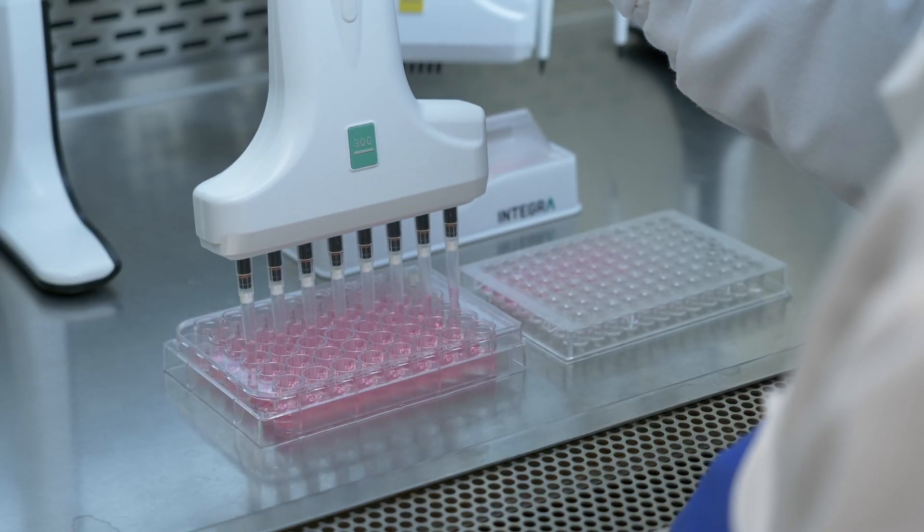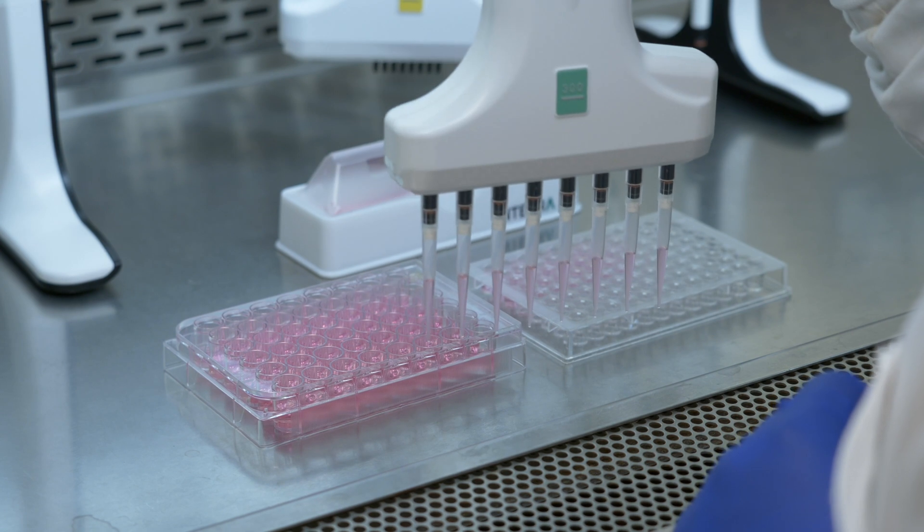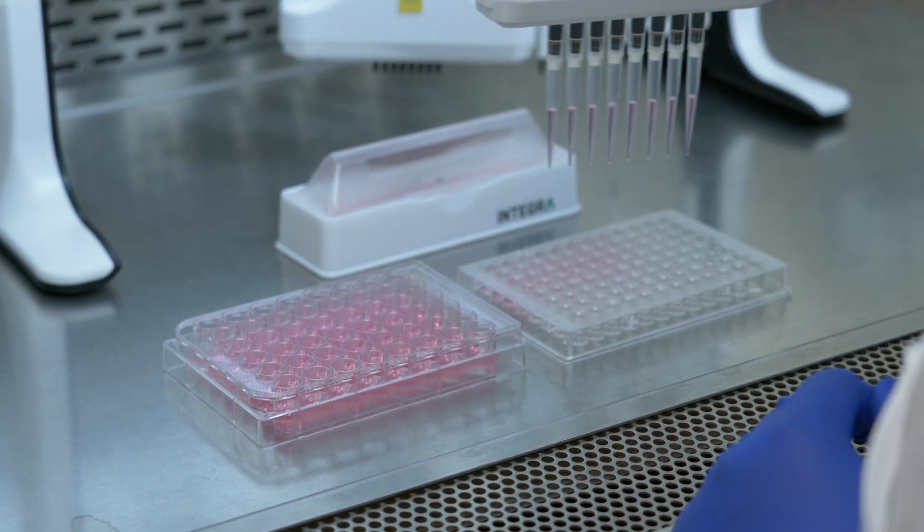Plus it's hard to remember where you are. When you're going into 96 wells it's very easy to go into the wrong well, so it does save human error in that sense.